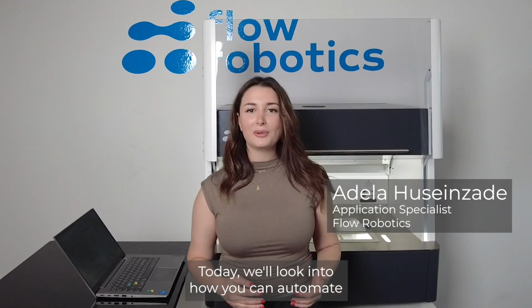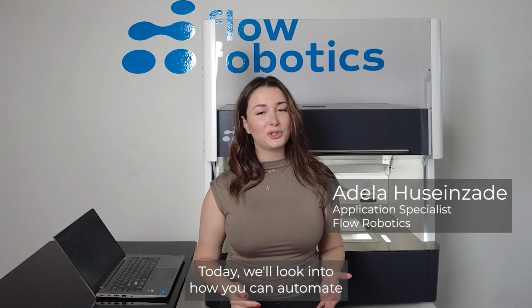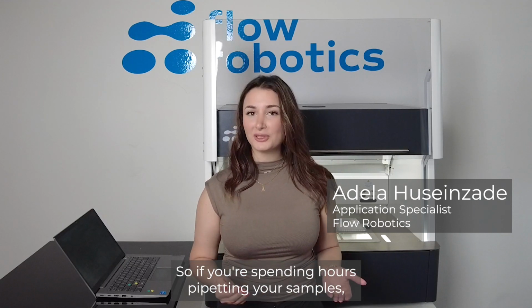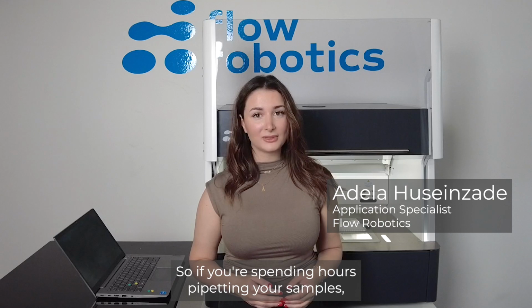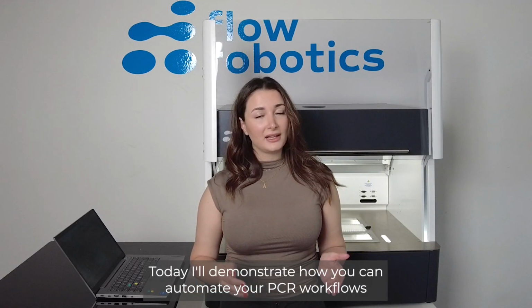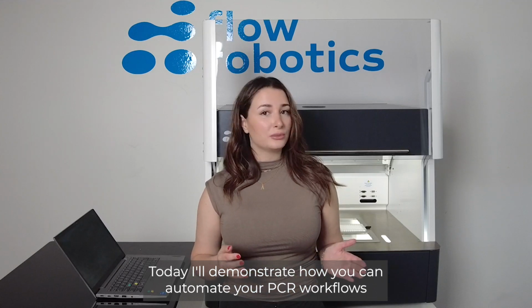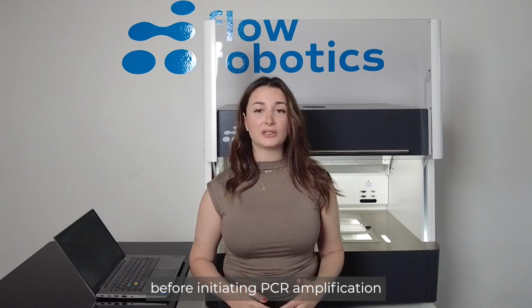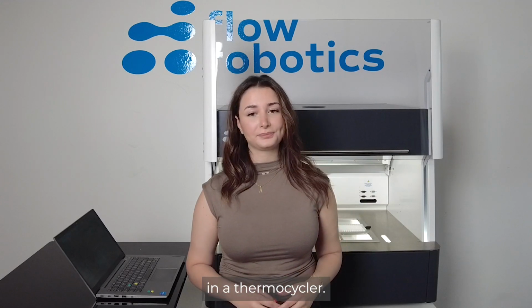Everyone! Today we'll look into how you can automate your PCR protocols using the flowbot 1. So if you're spending hours pipetting your samples, then this will be a game changer. Today I'll demonstrate how you can automate your PCR workflows before initiating PCR amplifications in a thermocycler.